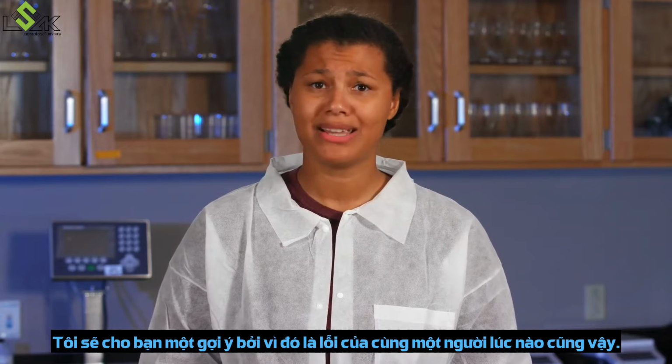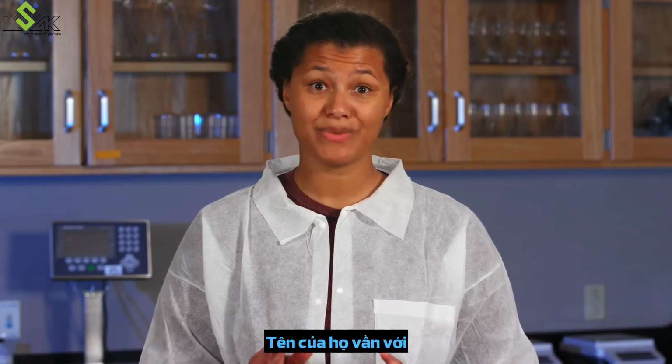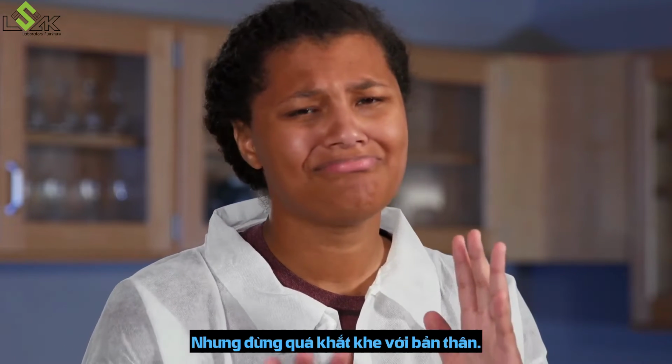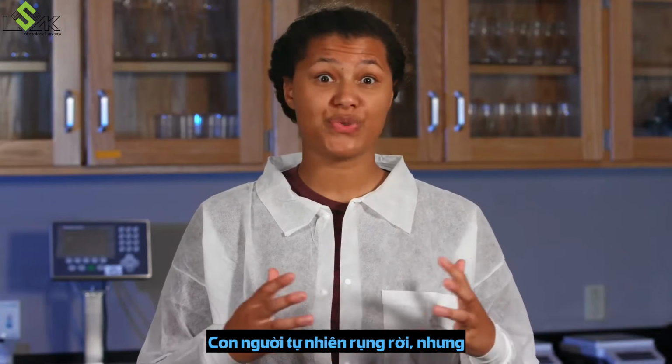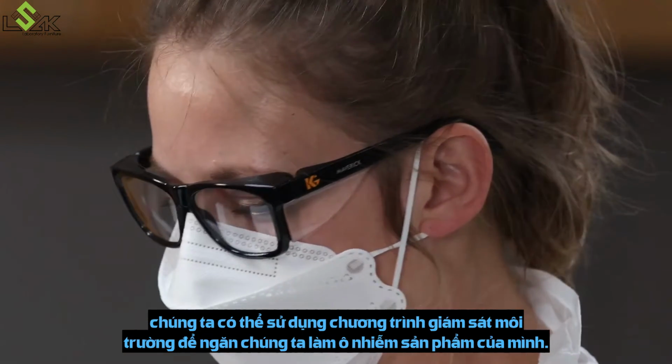I'll give you a hint, because it's the same person's fault every time. Their name rhymes with whatever your name is. But don't be too hard on yourself. Humans are naturally messy, but we can use an environmental monitoring program to prevent us from contaminating our product.